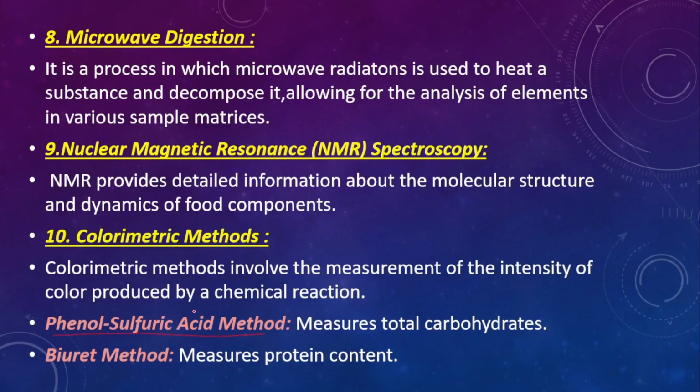It is particularly useful for analyzing sugars and starches in the products like syrups, juices, and the baked goods. This method is valued for its simplicity, sensitivity, and ability to provide quick results for quality control and the nutritional labeling. Biuret method that measures the protein content.